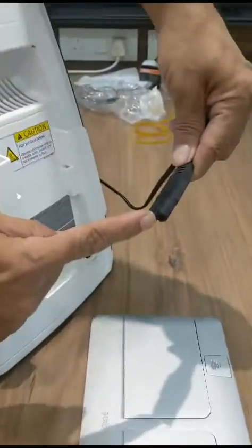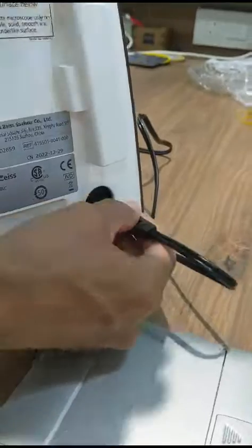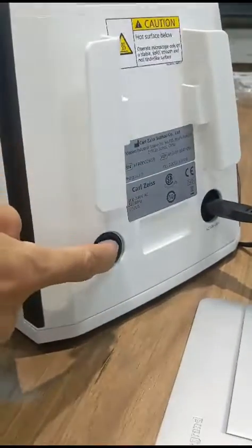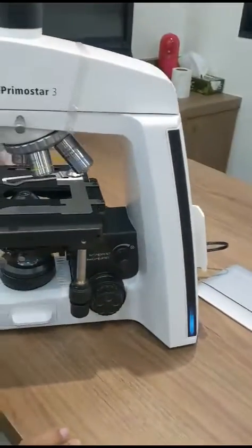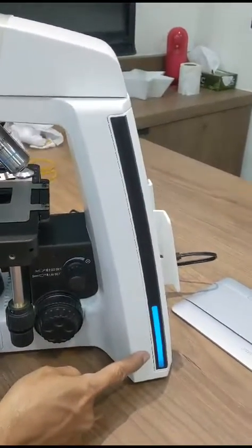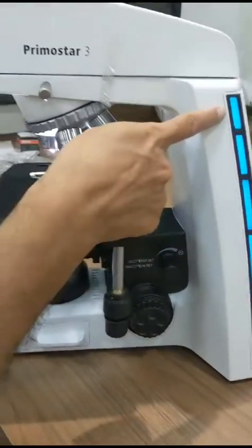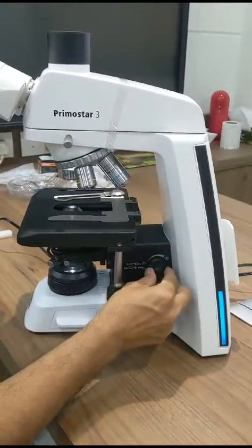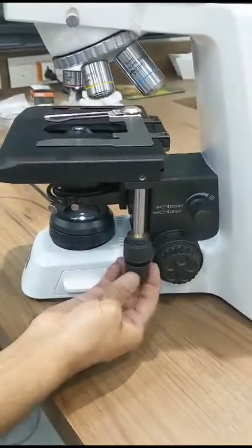At the back side you can see the main cord. This is the main cord — it is inserted here. You can see AC 220 volts. The main cord is inserted and this is the power on/off switch. We switch on the power. As soon as the power is switched on, you can see the blue light here. You can increase the light intensity and also reduce it using this light intensity switch.